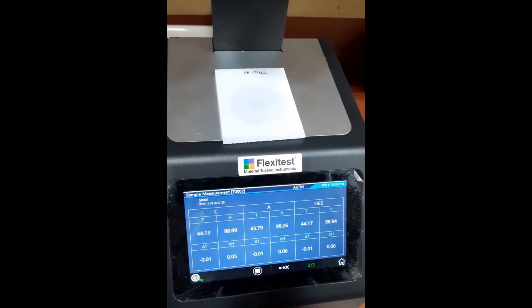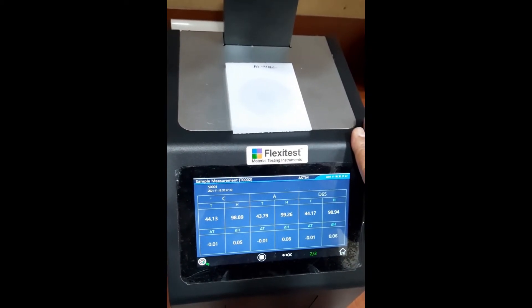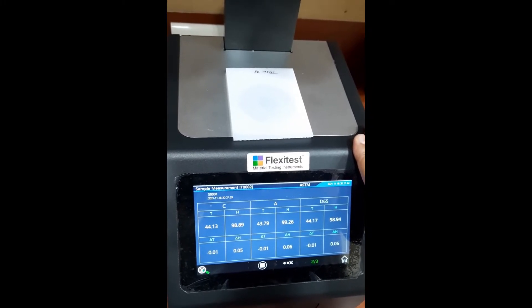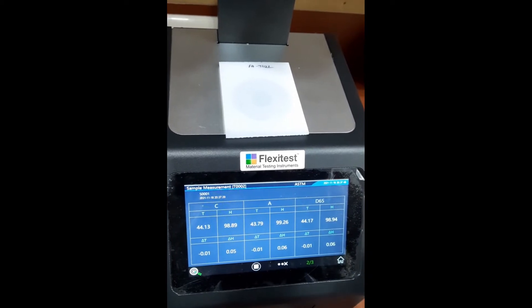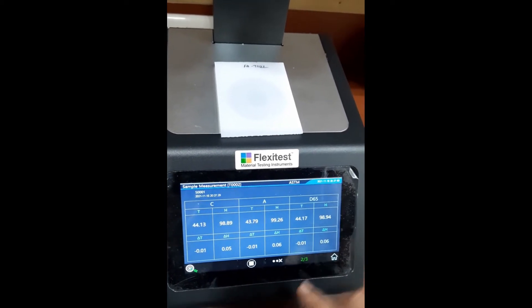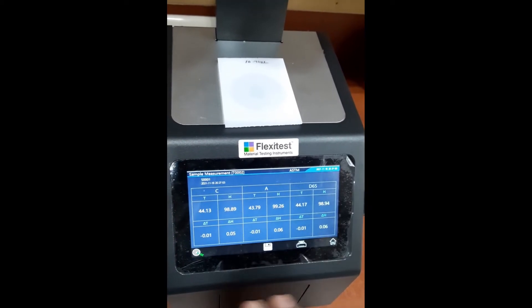Now you can compare. For a standard measurement, I need to take 3 measurements continuously, and it will take the average of 3 measurements and compare the average of 3 samples. This is the difference value. So this is 2 of 3 of the sample, and this is 3 of 3 of the sample, and this is the final result.